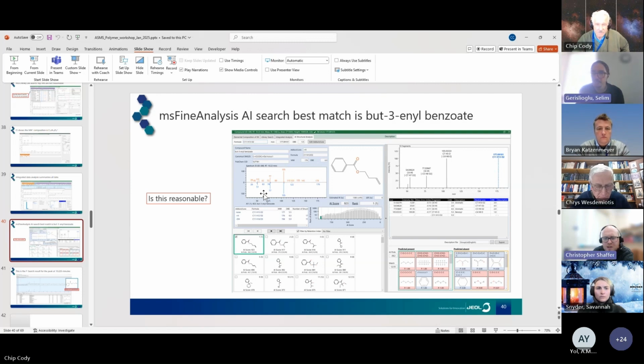I had two questions on the retention indexing. First off, is that based on some assumptions from the column inputs, like if you're using a DB5 versus a polar column, I assume? Yeah, essentially, if we're doing data from the NIST or Wiley databases, we can specify whether you have a polar or non-polar column. And if that data is in the NIST or Wiley databases, then we're essentially just filtering the outputs or flagging them if we fall outside of a specified retention index tolerance.